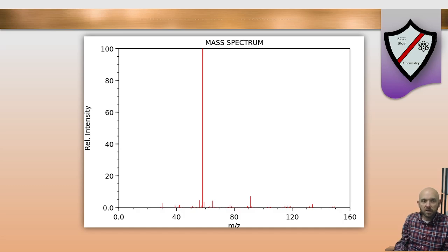And I always like to think about this in terms of your favorite forensic criminal investigation show, because they always treat the mass spectrometer as the miracle machine. If you're paying attention, it's the instrument they use when they take the unknown substance and they throw it in some big box, and it spits out the identity of the substance on the other side. And it's always the mass spectrometer that does that. And this is the graph that a mass spectrometer actually generates.